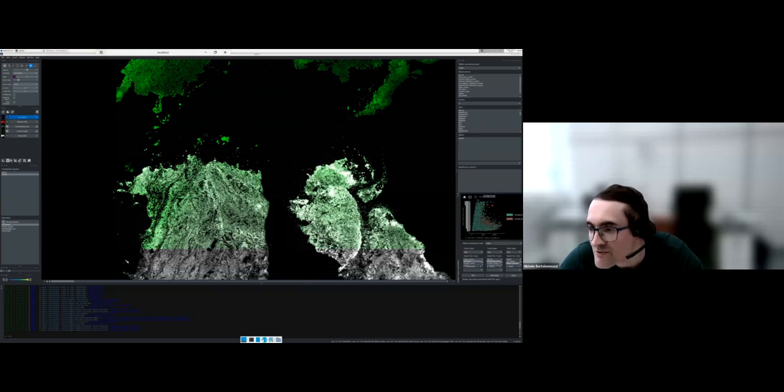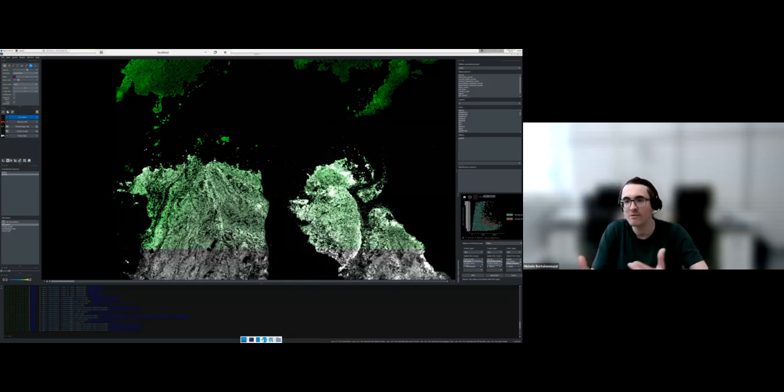Oh, okay, it's moving. Here I can see which cells I'm looking at from which sample, and I could even make a selection and annotation to then save in the object. Here I am just selecting by cell area and transcript count, but of course if you instead wanted to display the expression of your genes, you could.